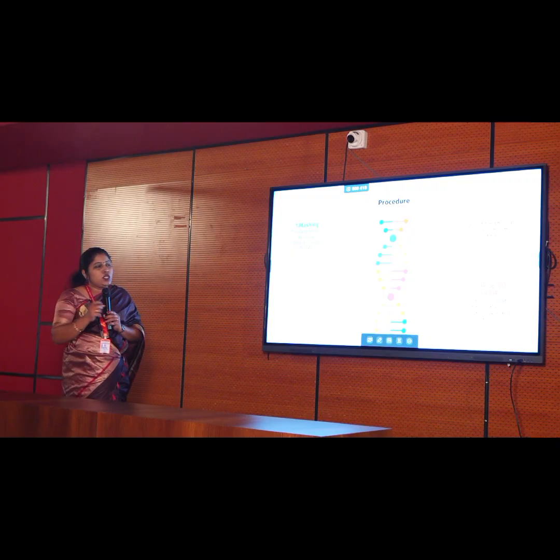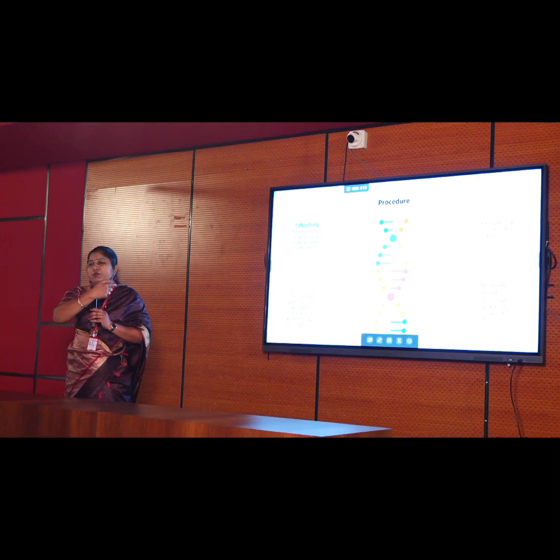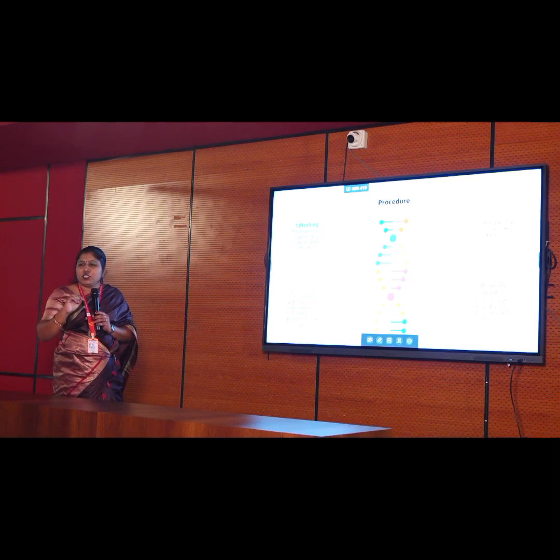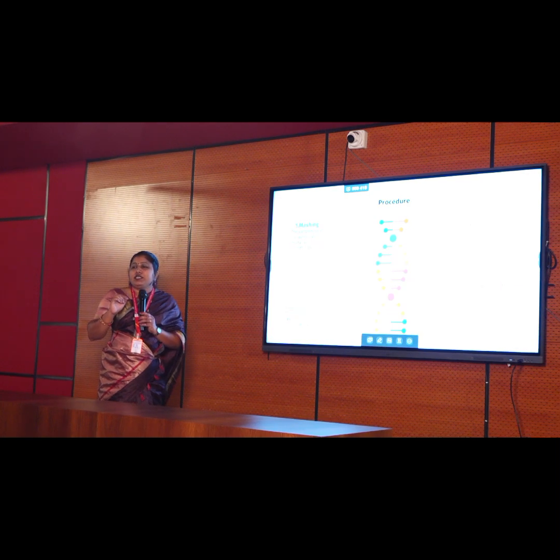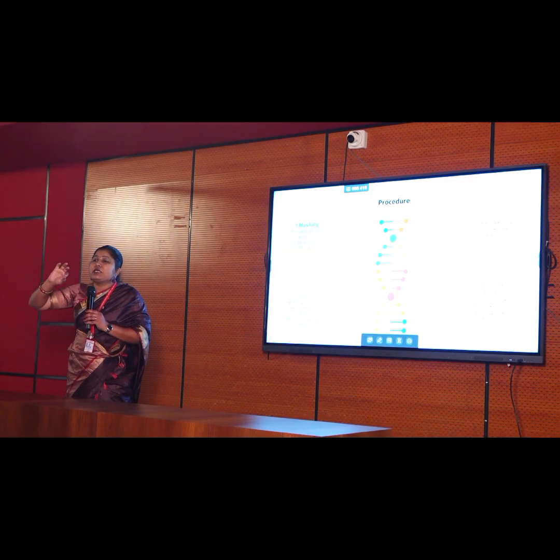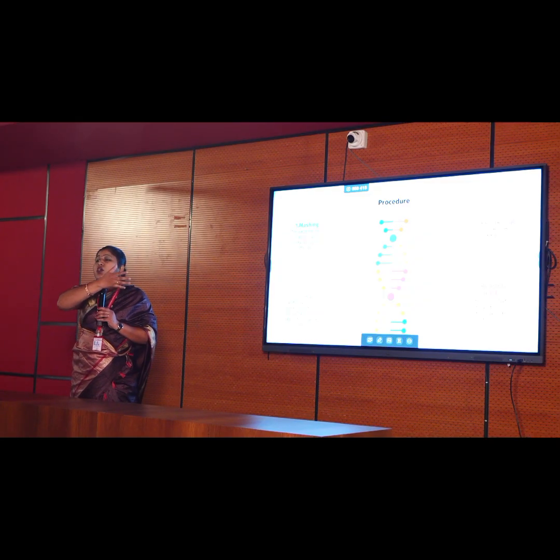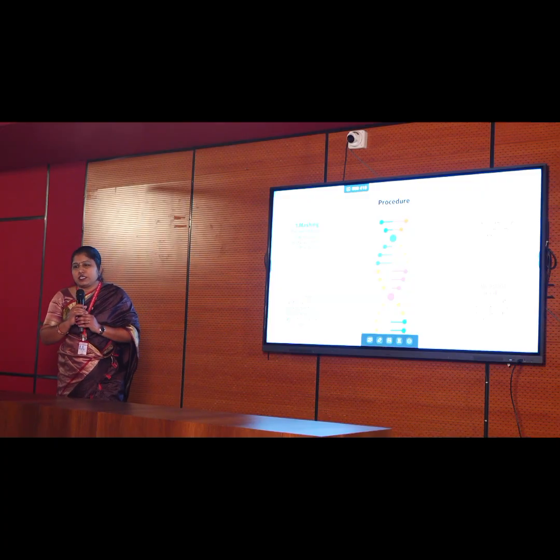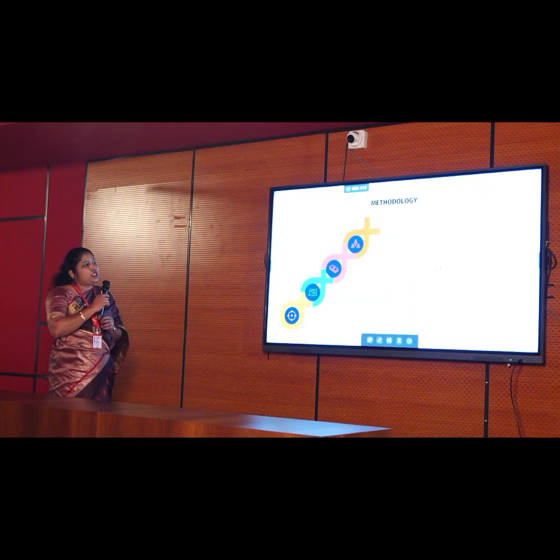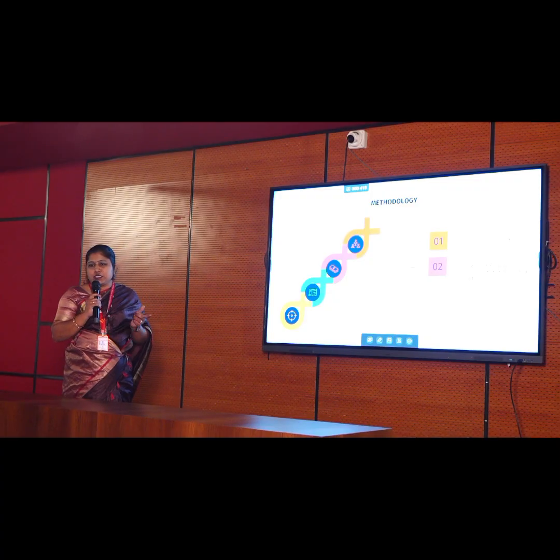The final step, how we collect the DNA separately, is by the precipitation method, where we added ethanol, which is an alcohol. It clumps all the DNA molecules together in the cytoplasm and separates them from the cytoplasmic contents, so that we can separate them using other techniques and go for the technological aspects of STEM. Methodology: the pedagogical approach was inquiry-based, it was experiential learning.